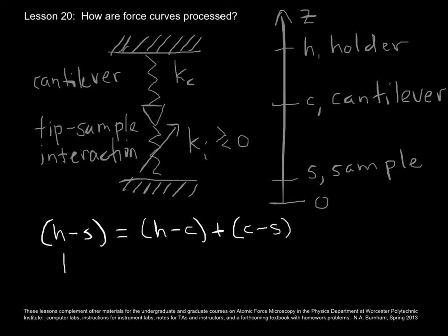That could also be written as the total force divided by the total spring constant, where the total spring constant is some combination of Kc and Ki.